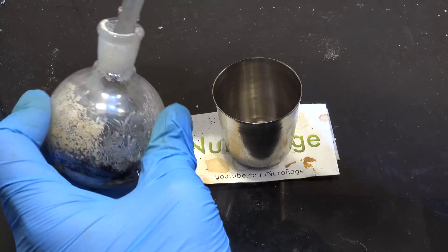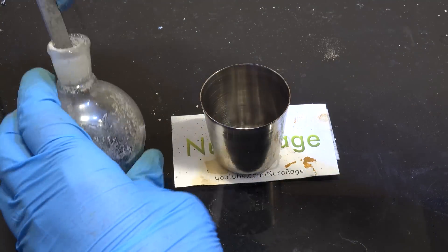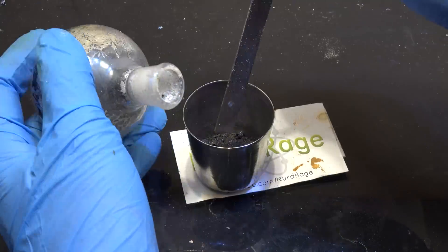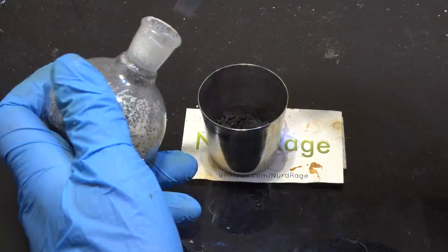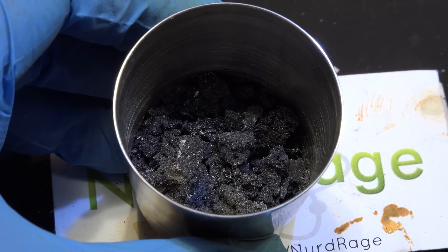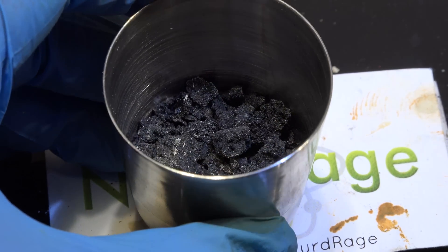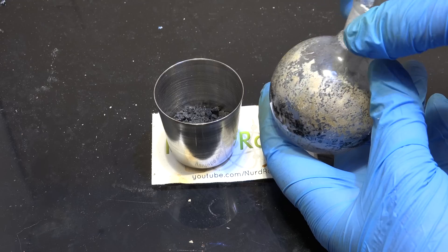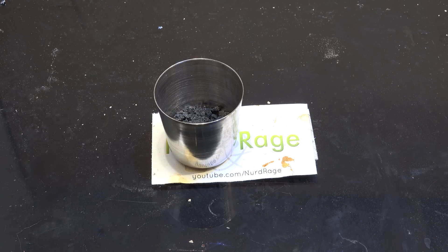Now scrape it out and transfer it to a crucible. If you've dried it enough then it should crumble and fall out fairly easily, but if it's sticky or syrupy then you'll need to heat it again higher. Most of the platinum waste is now in the crucible. I'm not going to bother getting out everything since I have more platinum waste to process, so I'll just reuse the same flask for additional boiling and volume reduction.